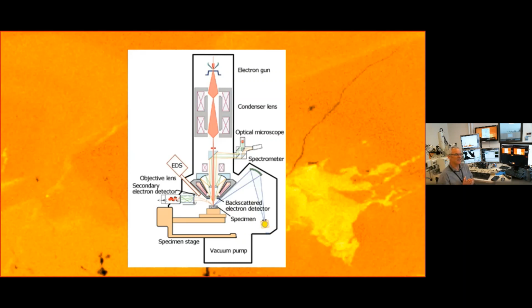So very, very sensitive to small changes in X-ray wavelengths. Okay, so we can be very selective at the X-rays we detect. These, as I said, are tunable. This is the motor here, so we can change the position of this crystal and the detector to get different wavelengths in that spectrometer or in that detector. And why are these spectrometers better?